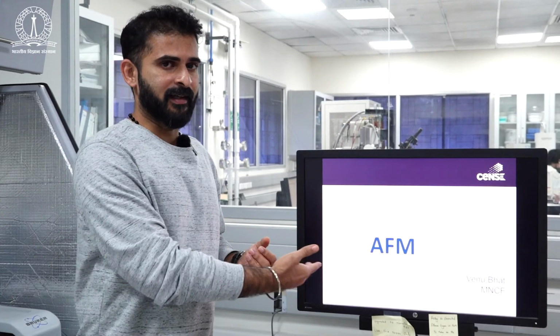Today we are here to talk about atomic force microscope, AFM. We have two atomic force microscopes at MNCF, that is in Center for Nanoscience and Engineering, Bangalore. So what is atomic force microscope? Not many might know. Microscopy is a very familiar topic, but AFM might not be such a familiar topic. Let's go and see what that is.